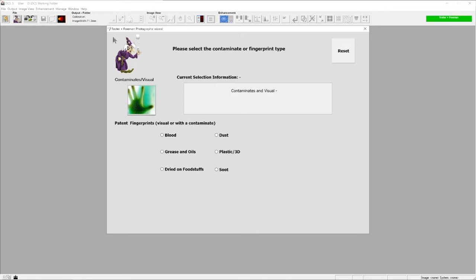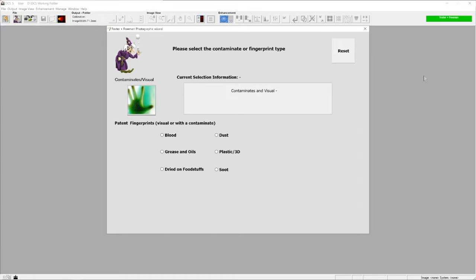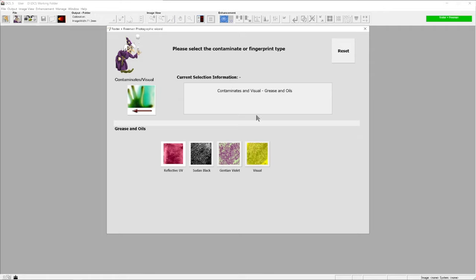Once we have come through to that stage, the next thing we have is the surface or, in this case, the type of contaminant that's on the surface. It may be a grease finger mark.